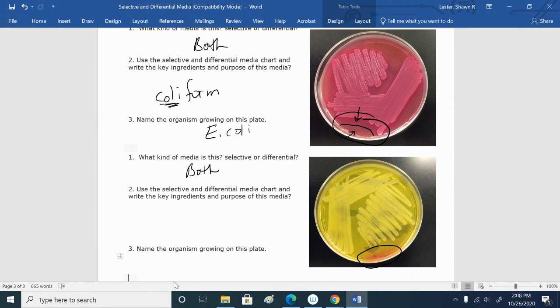So we have yellow agar. So which type of staph is this? Staph aureus. Right, Staph aureus. Right, because if you're growing staph, it's the only staph that turns the agar yellow. So all staph will grow, but when you're actually doing this test, what you're looking for is the agar turning yellow, right? If it's not turning yellow, that's considered a negative test result, right?